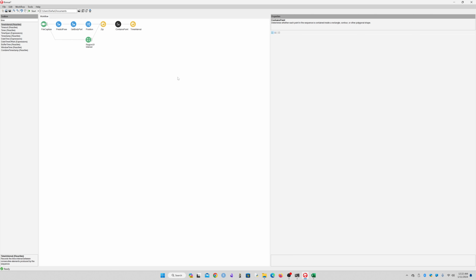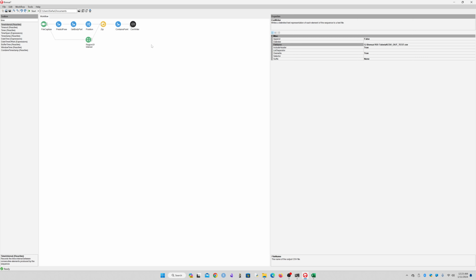Now, in order to get the entry and exit data out of your CSV file, let me go back to this. In order to get the CSV file to give you the entry and exit information, you need to count the transitions between true and false. So for example, if a mouse enters an ROI, then the values are going to go from false to true, and that transition should tell you that the mouse has entered that ROI. And there are Excel formulas, again, that can help you do that.